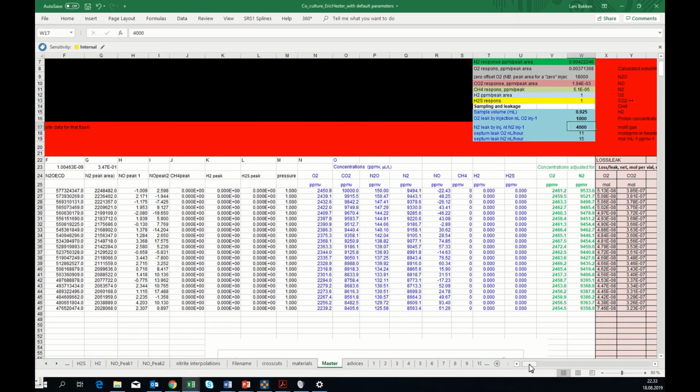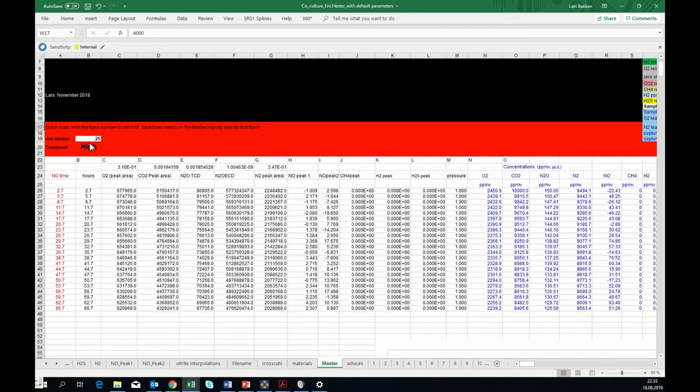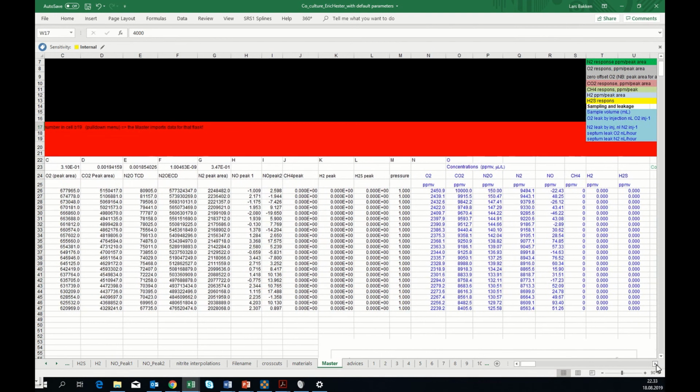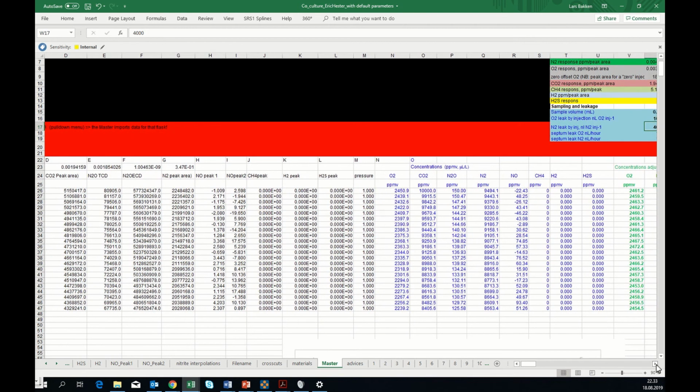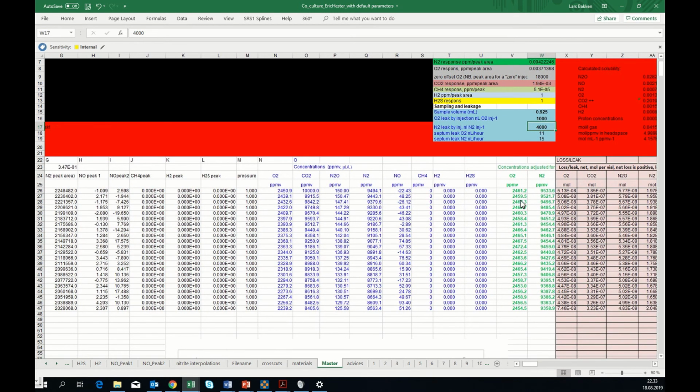So we have already in this sheet here imported the high standard, which has not impressively low initial concentrations of the two, because the person who made this experiment has been sloppy about helium washing, but it still is low enough to estimate the leakage. So we can start with oxygen, and we do the same exercise again.